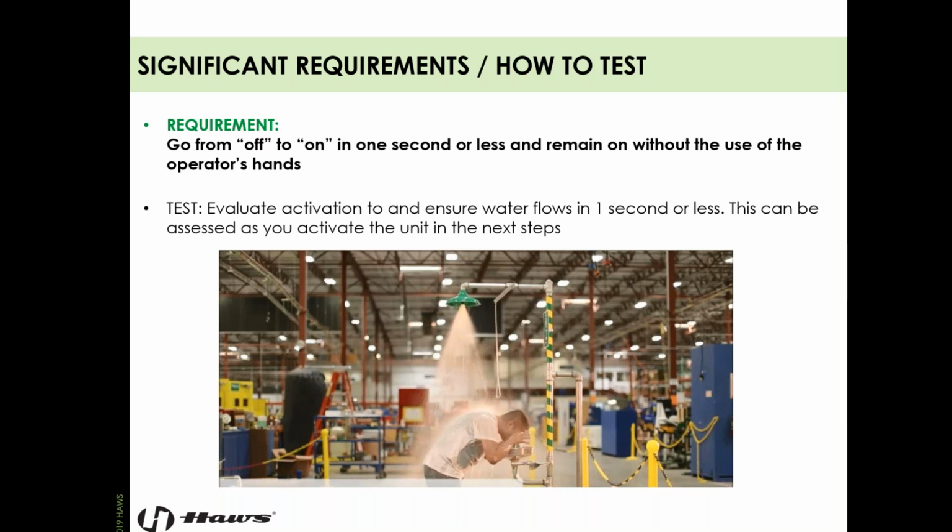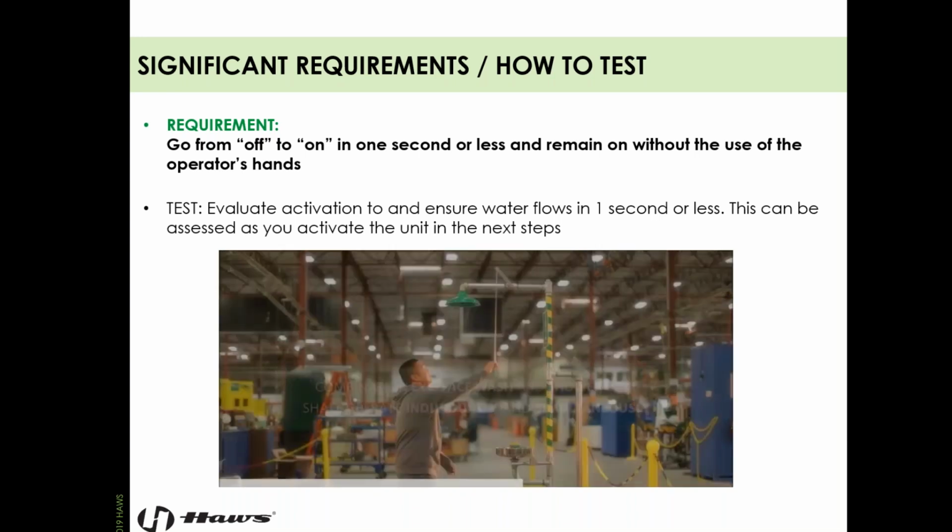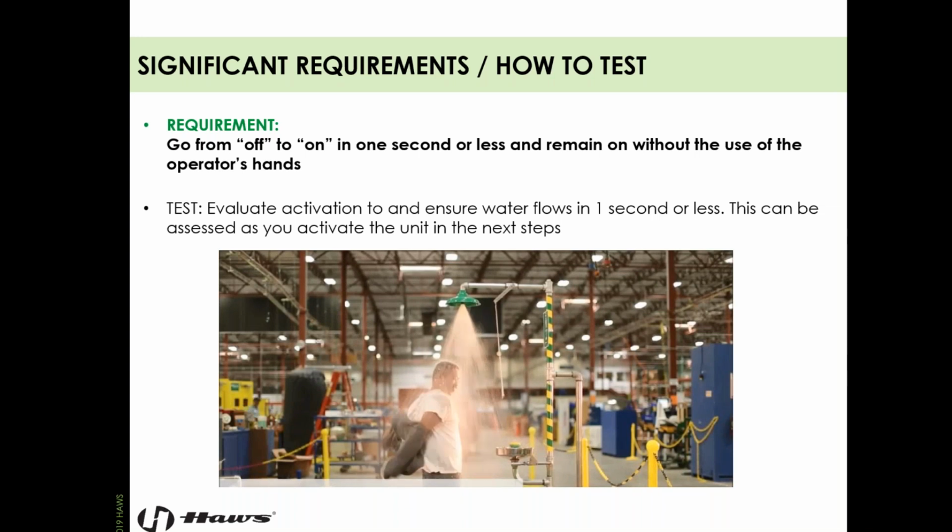What used to be very popular were self-closing valves, and self-closing valves still show up here and there on emergency equipment, but they have to be stay open valves for all emergency equipment. Otherwise, if you can imagine for a second having to hold the eye face wash open, hold the shower open, you're removing clothing, you're holding your eyes open and things like that. I can rub my belly, I can pat my head. I don't know if I said that in the right order, but I can do that, but I can't do that and do all of this stuff at the same time. You have to have your hands free for this emergency. You have other things to deal with. So very important, they have to stay open.